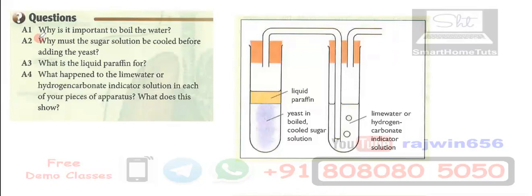The next question: why must the sugar solution be cooled before adding the yeast?